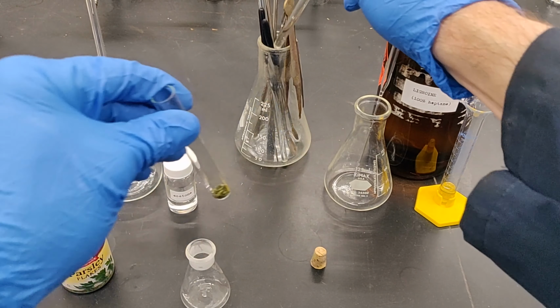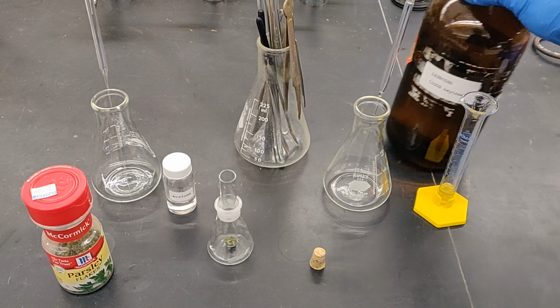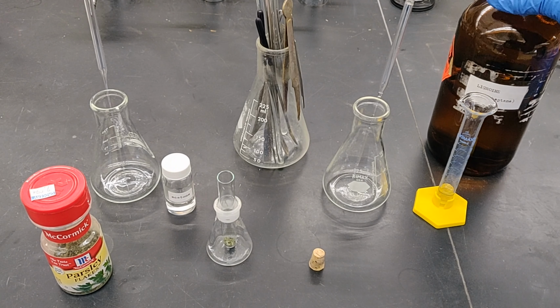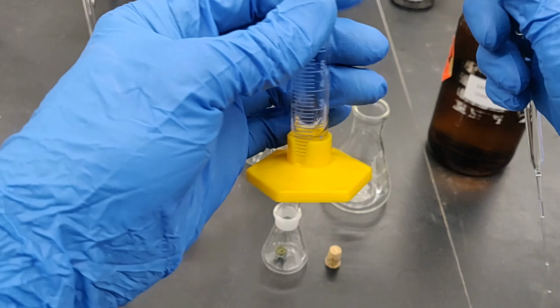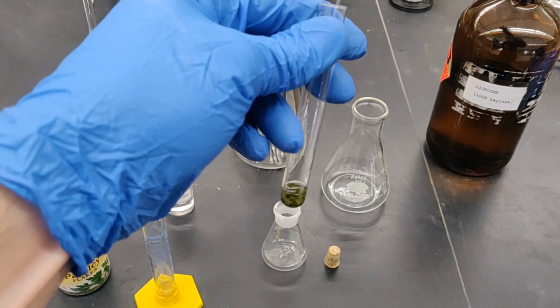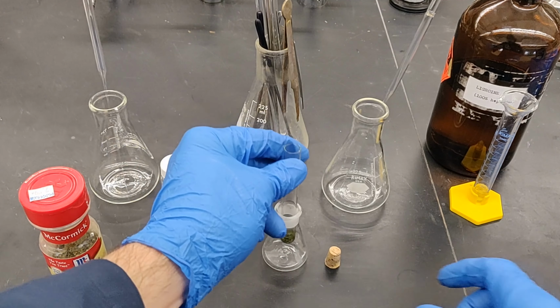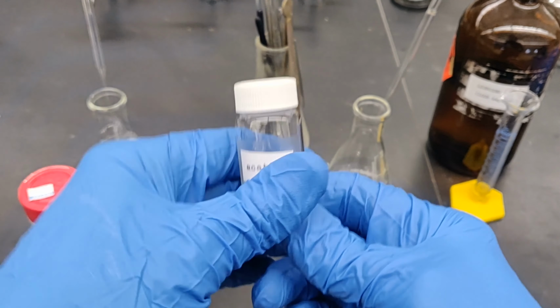To the tube containing the dried leaves, add approximately 1/2 milliliter of a hydrocarbon solvent such as Ligroin, in this case 100% heptane. Then add 3 drops of acetone to the tube.